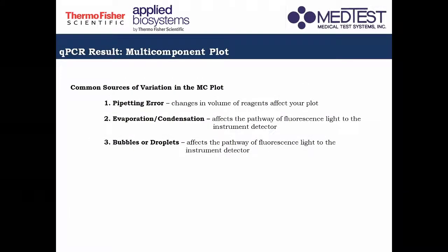Now, the common errors that we can encounter by checking the multi-component plots are stated here. No? So, usually, pangit yung curves na makikita natin sa multi-component plot pag nagkaroon po tayo ng pipetting error.